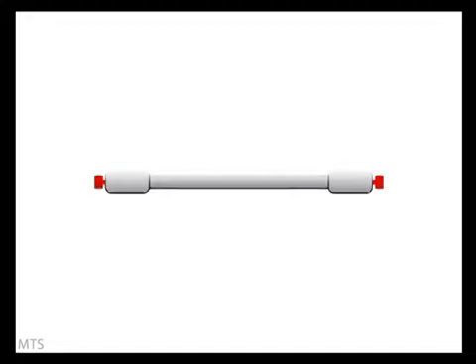At the heart of all HPLC systems is the column. This is where the separation of the components of interest in your sample actually takes place. It is the interaction of the stationary phase contained in the column, the mobile phase, and the sample components, which forms the basis of this analytical technique.